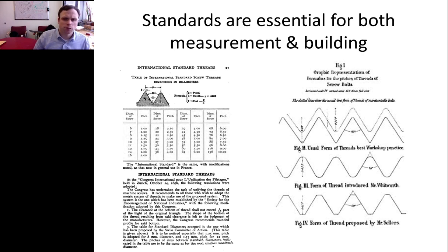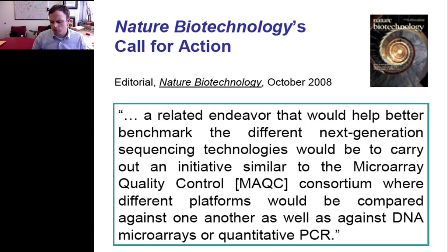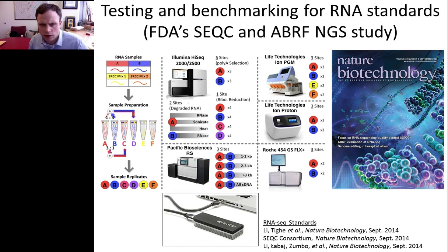And so some of the background, this quest to have better standards and metrics has been borne out by editorials from Nature Biotechnology to say that we need better ways to characterize some of the newer technology, particularly in sequencing. And we've published a lot of work on RNA sequencing to look at what are the standards and best practices across platforms. In this case, you can see here some platforms for RNA sequencing and now, more subsequently, nanopore-based sequencing.